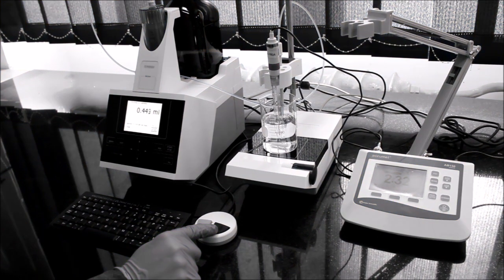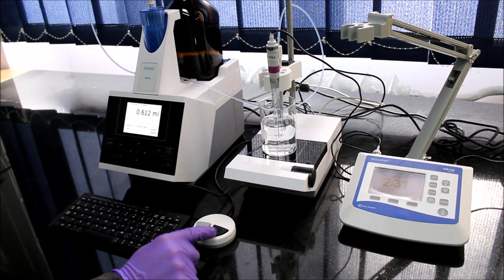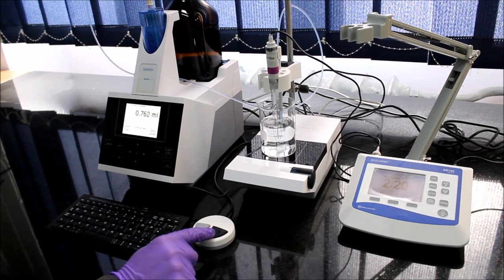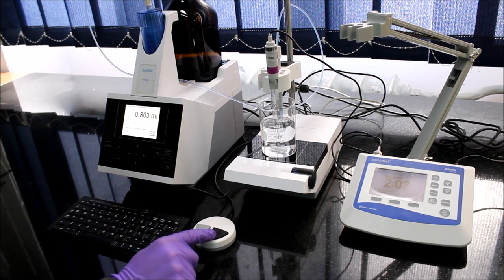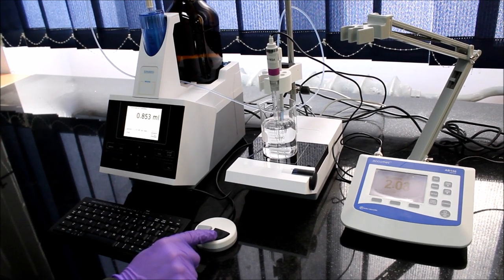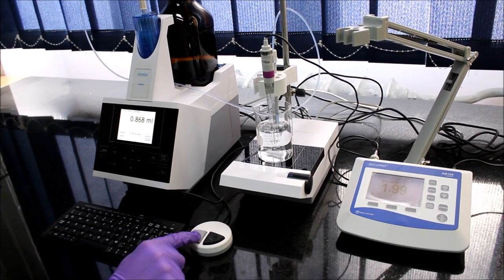In the real titration you should write down the volume of titrant solution added along with the corresponding pH meter reading to create a valid titration plot. As you can see, the pH of the solution is decreasing. When there is no more significant change in pH of the solution, we can stop the titration.